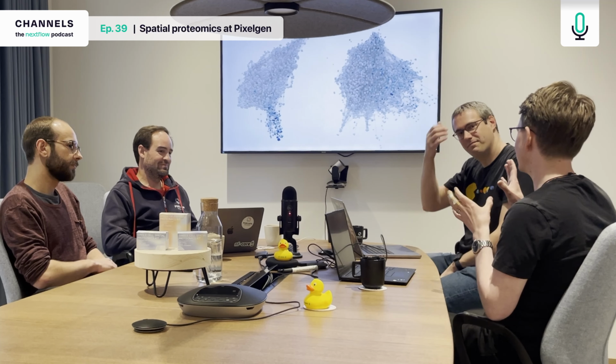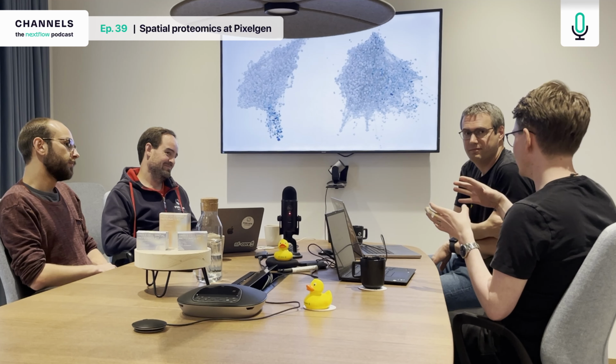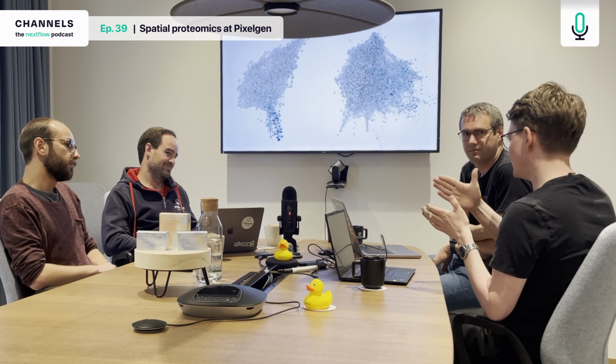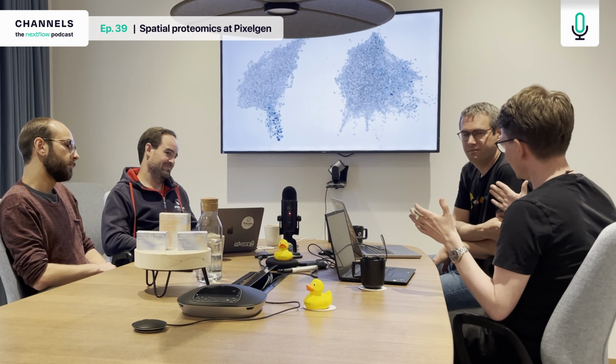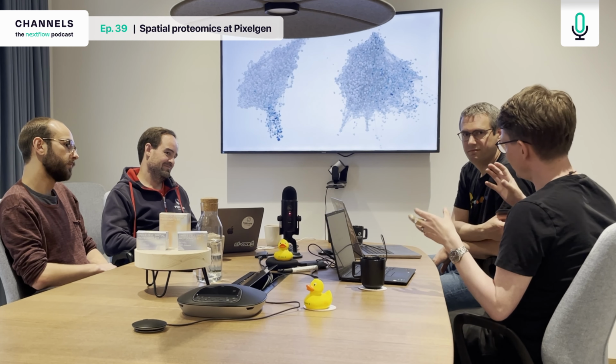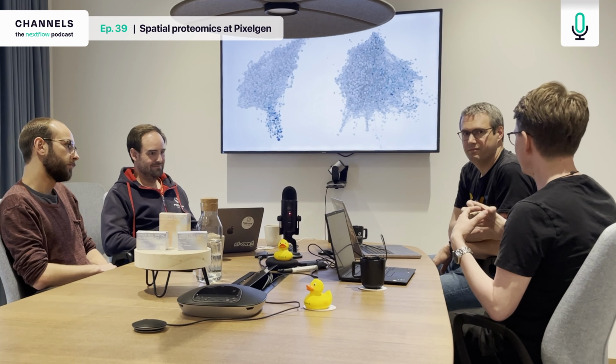And I think one of the things to really highlight is the multiplexing that you can do at the same time, because it's not only that you're getting single snapshots of all 80, you get all of the 80 at the same time. So we tend to talk about two big spatial statistics. One is polarity, which is a measurement of how clustered the proteins are on the cell surface, and that's calculated per protein.